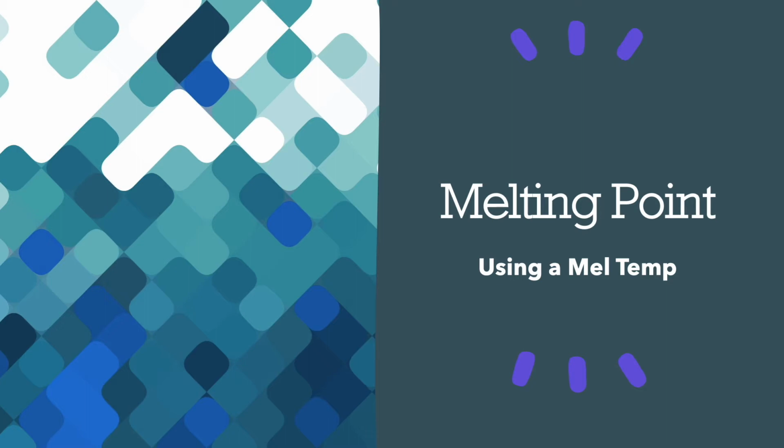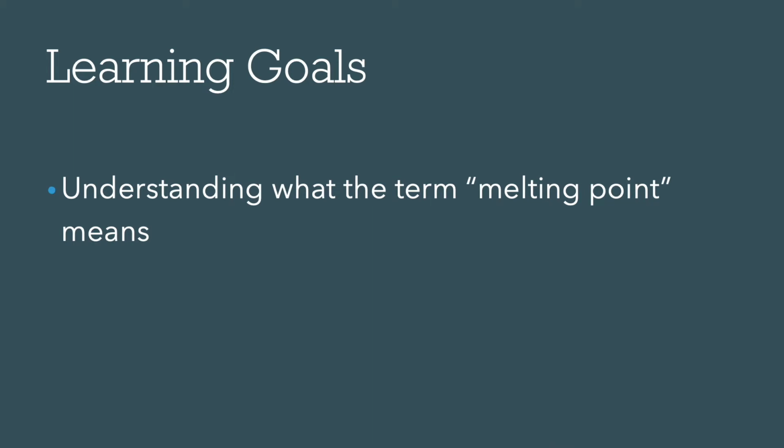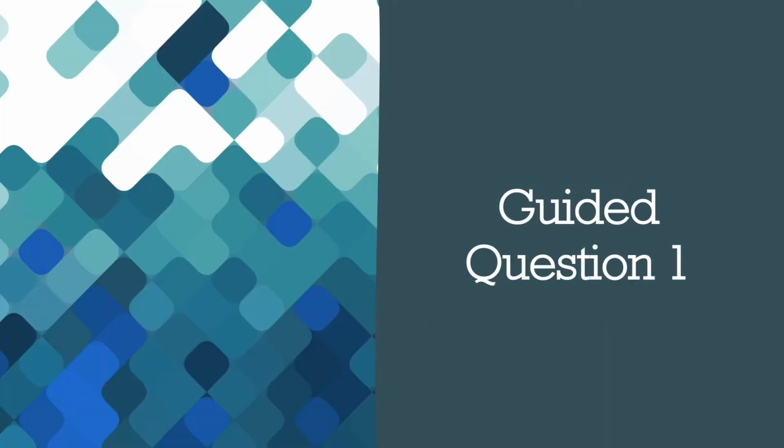Today we are going to be discussing melting point and more specifically how to use a Mel Temp. Our learning goals for today include understanding what the term melting point means, being able to correctly operate a Mel Temp, and being able to analyze melting point results. As we progress through the video and into the pre-lab, be sure to keep these goals in mind.